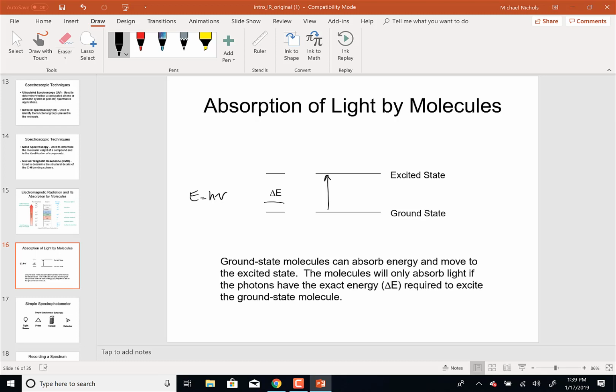So using light, we know that we can separate light into its wavelengths using either prisms or, if you ever have a CD, I don't even know, CD's passe now. But if you had a CD and you held it up to the light, you'd see the rainbow effect. The CD is acting like a grating, and so it's separating the different wavelengths of light. So we actually use kind of both in instruments. We might use prisms or we might use gratings to bring in white light and then separate it into its different frequencies or wavelengths.